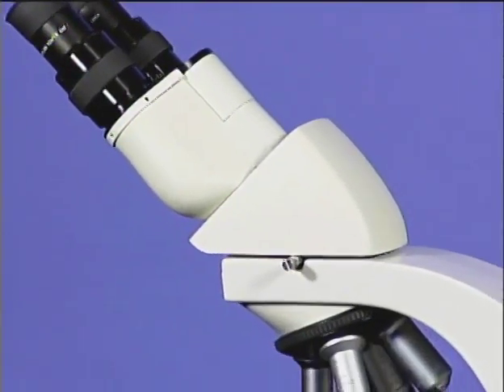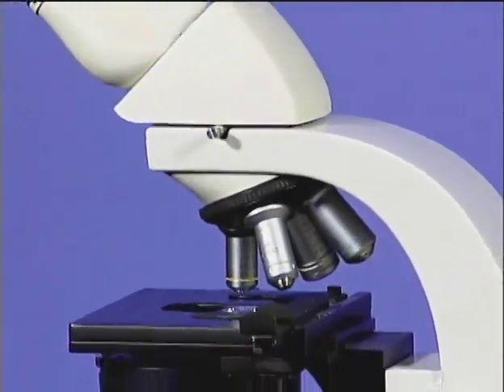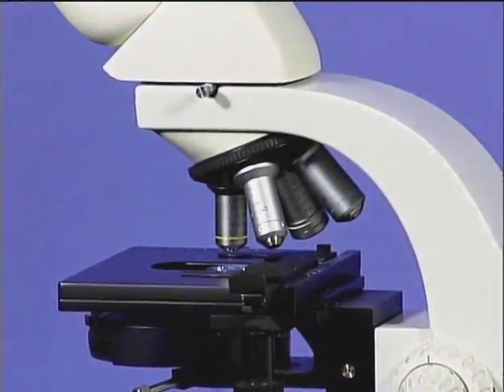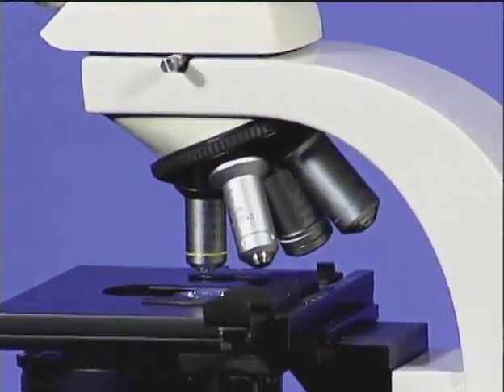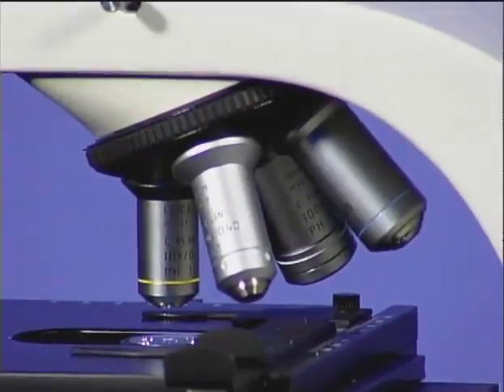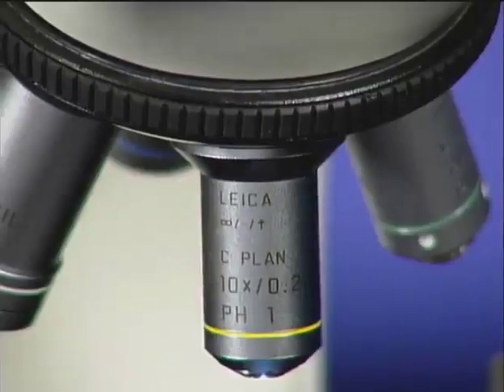The two lens systems that actually produce the magnified image are the objective and the ocular lens systems. The images produced by these two lens systems differ in an important way.